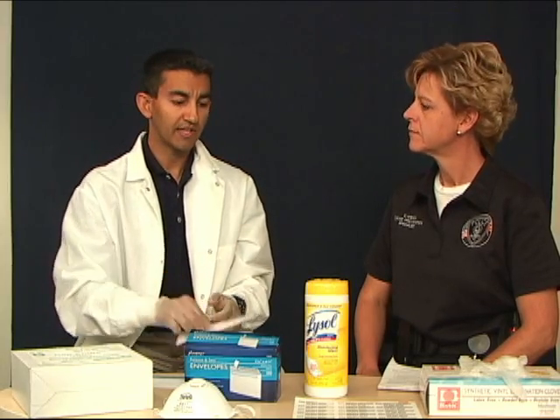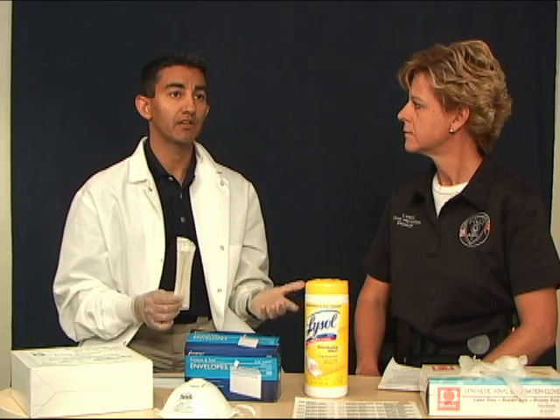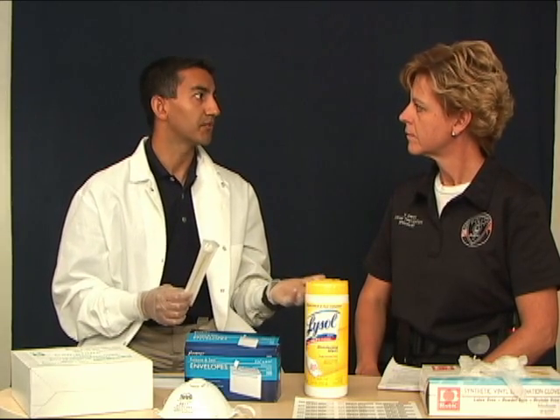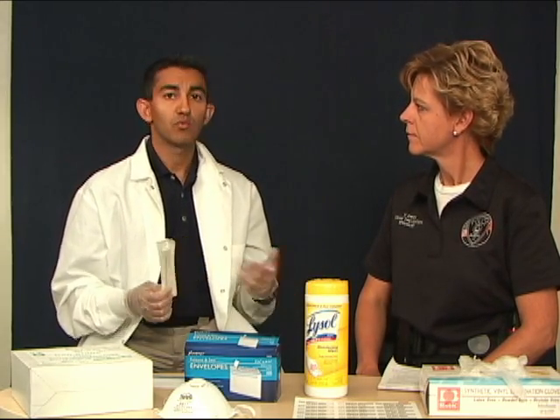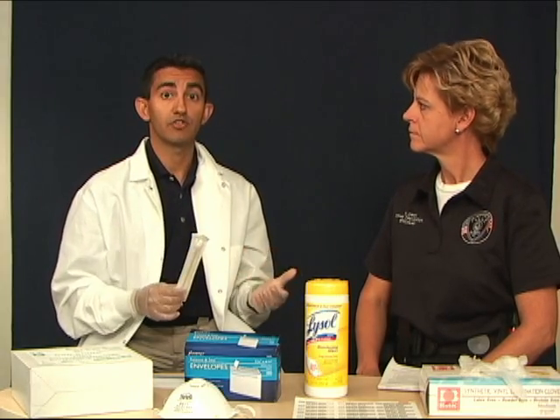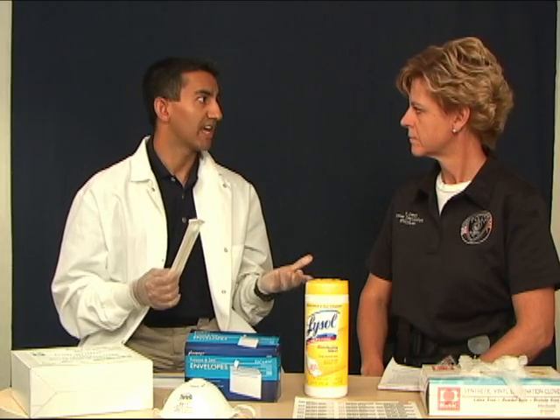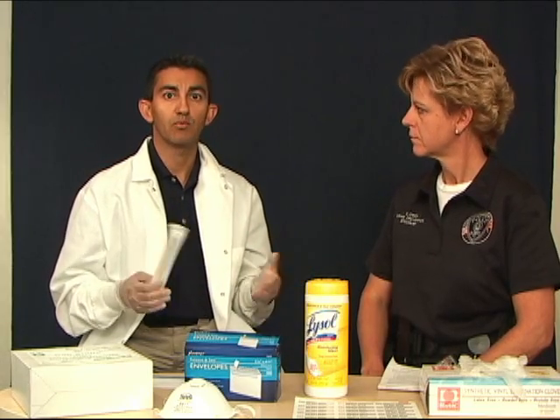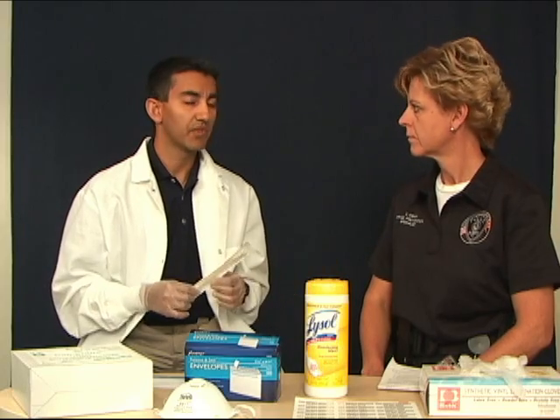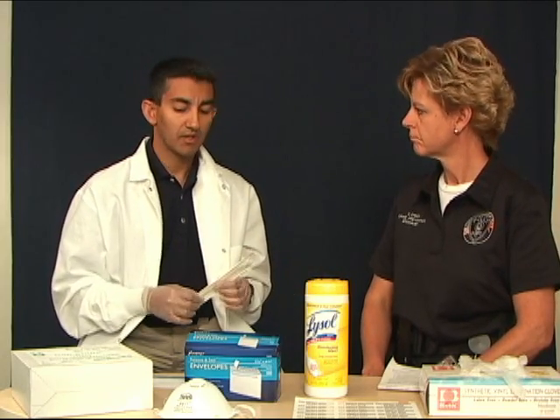When it comes to collecting DNA, since we're taking it from a child, we want to make sure that they haven't eaten for the previous 30 minutes. 30 minutes to an hour, but 30 minutes is good enough. The reason is that when you eat foods, there's going to be DNA from the meat or whatever you ate that sticks to the inside of your cheek. When you swab that, you're going to get remnants in the sample, and that could alter the profile when it needs to be extracted. So try not to eat or drink anything for the previous 30 minutes.